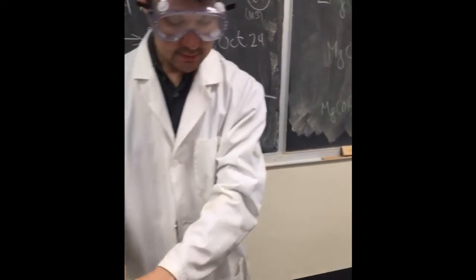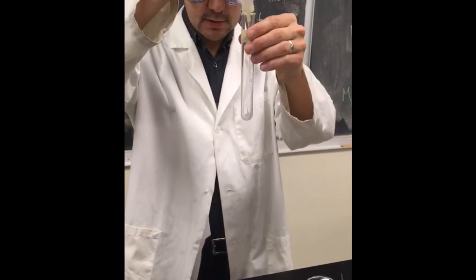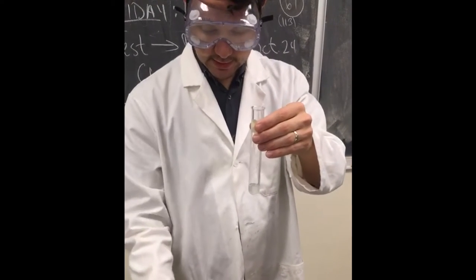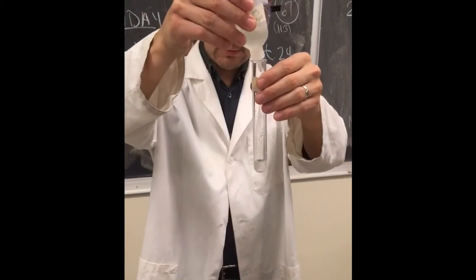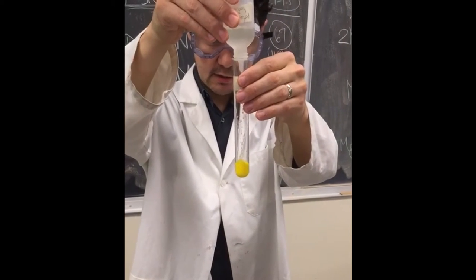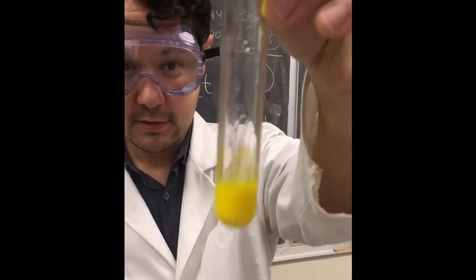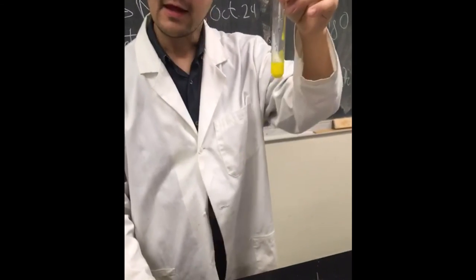There we go. Next part, this is a separate reaction with lead nitrate. This is reaction D. We're going to take a little bit of this, and then some potassium iodide, and see what happens. And we get some instant yellow mustardy color solid in there, which is a precipitate. Yeah, very intense. Okay, so that's the production instantly of a precipitate. And that's it. Thank you.